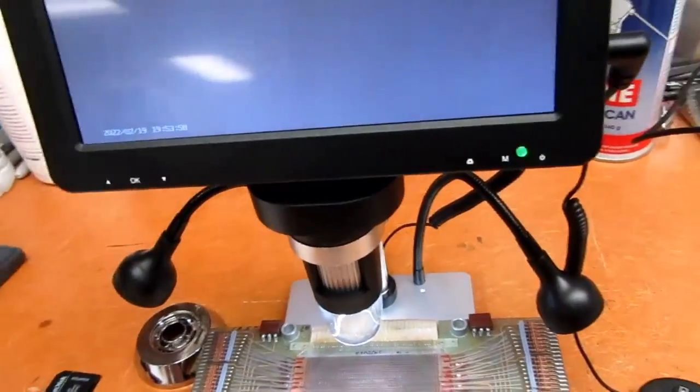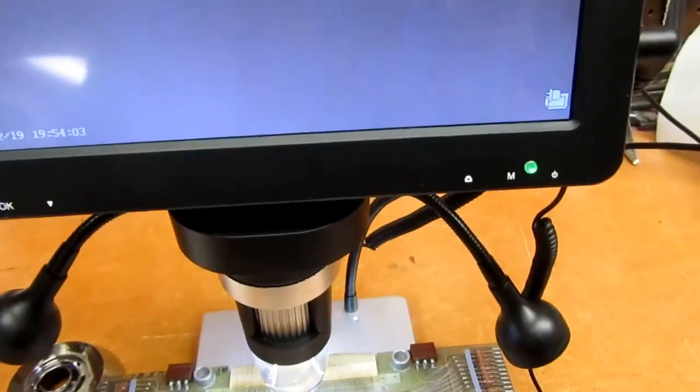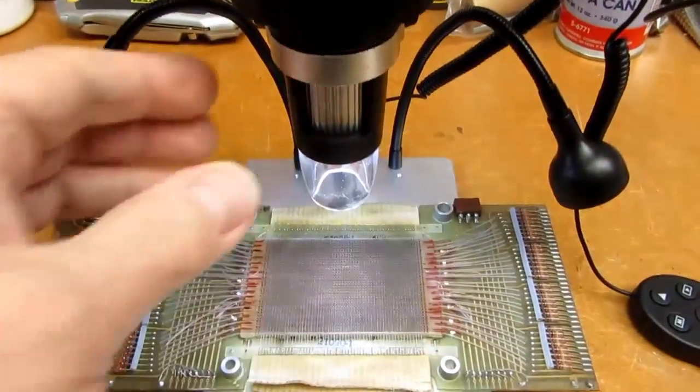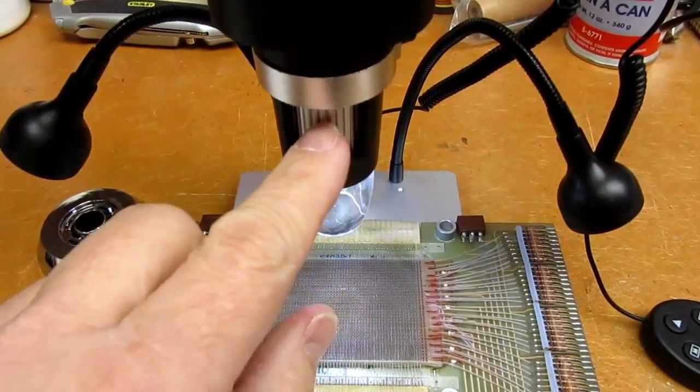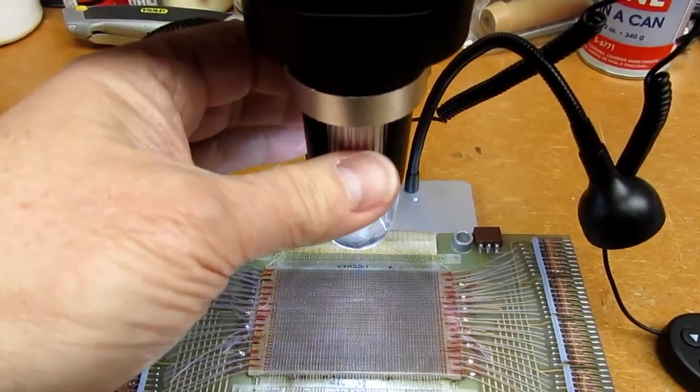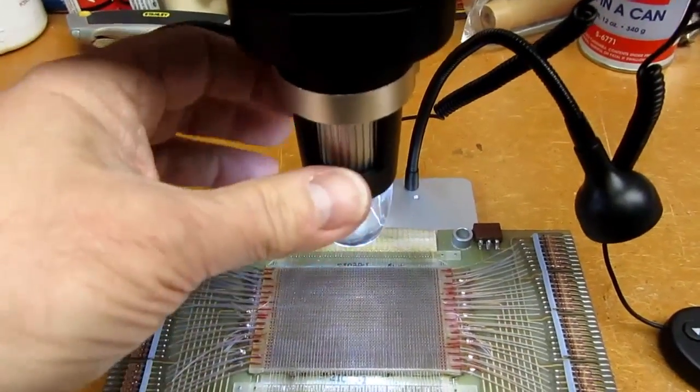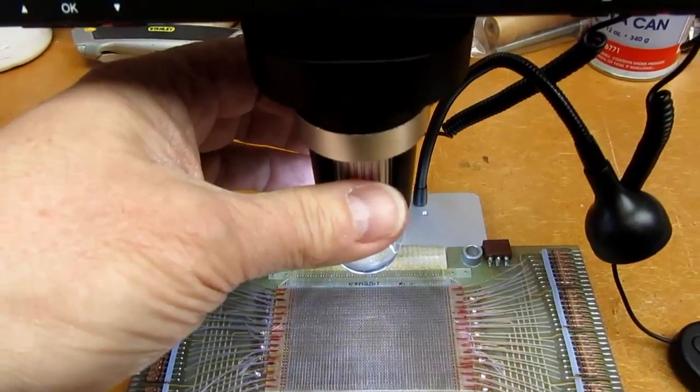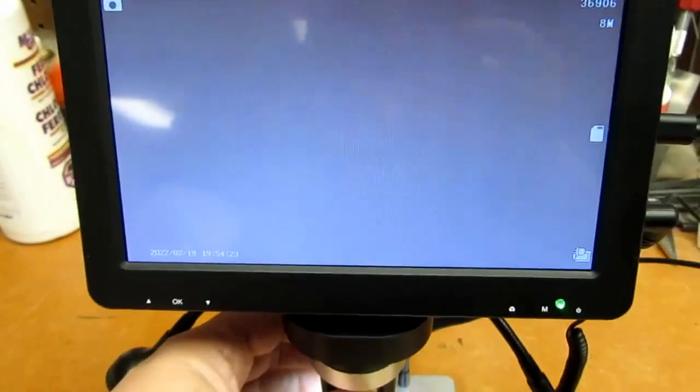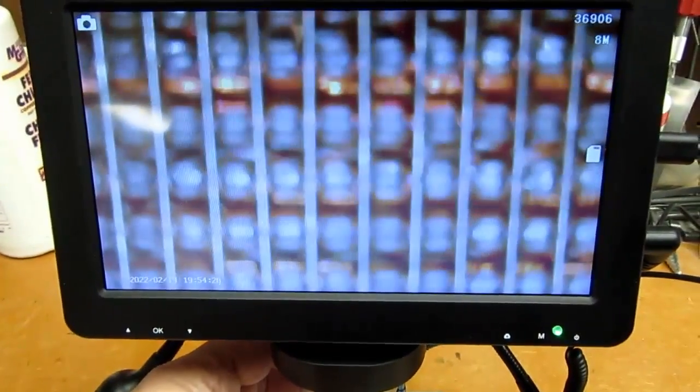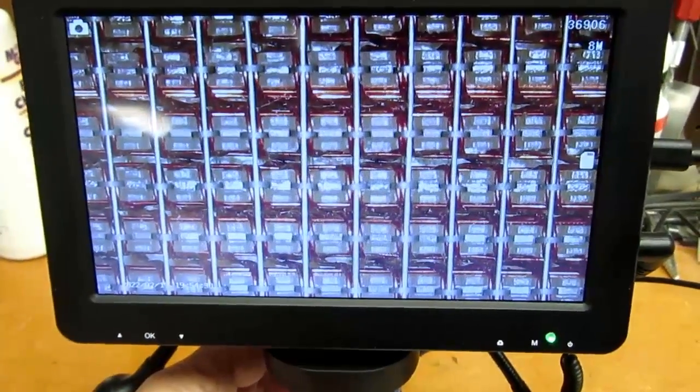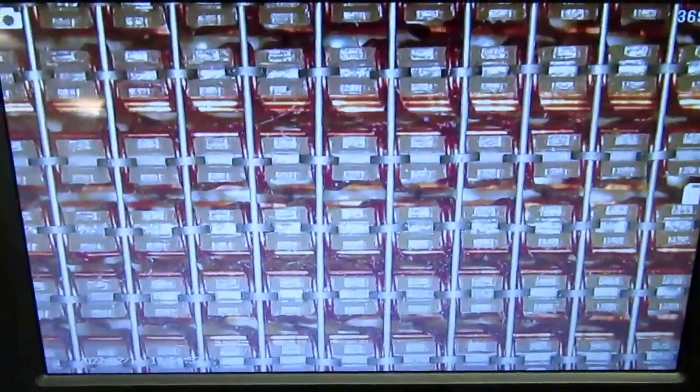I'll start out with it raised up. That should be the lowest magnification. Right now it's just showing nothing, but I think that's probably because it's just highly out of focus. So this knurled focus wheel is accessible from the front and the rear. So instead of just rubbing a finger past it, you can actually grab it between thumb and forefinger and turn it. So let's see. Now we're starting to get an image. There we go, looking down at that tiny core memory.